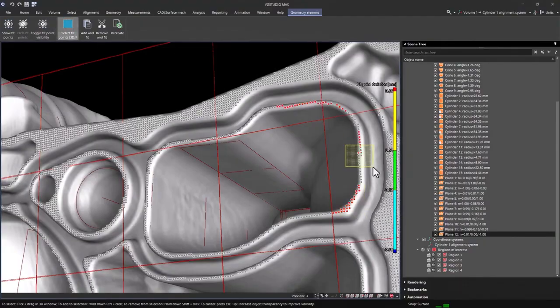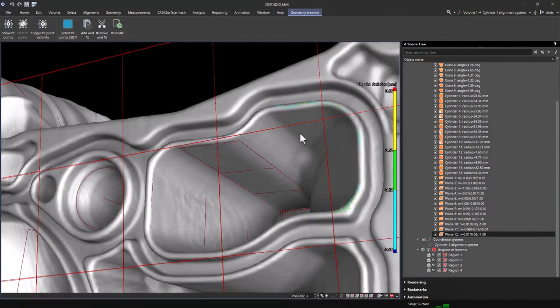Change your selection using the Control or Shift buttons and select single points by clicking the bubbles. No need to guess where the fit points are. Just adjust your view, draw a shape, and select the desired fit points interactively.